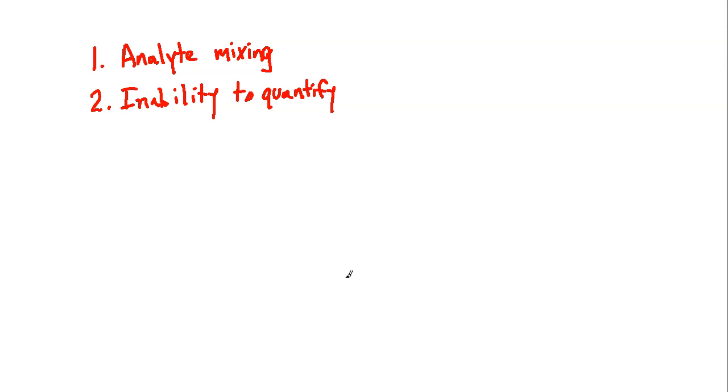You're going to wear the stationary phase down, and you can end up having issues. So if tinkering around with these different factors we're about to talk about doesn't seem to work, then there is a probability that you may need a new column. Okay, so I don't want to rule that out and think, oh, just for saving money, we'll constantly keep playing with these other factors. It may be that you need to replace your column, especially if you've had it running for a while.